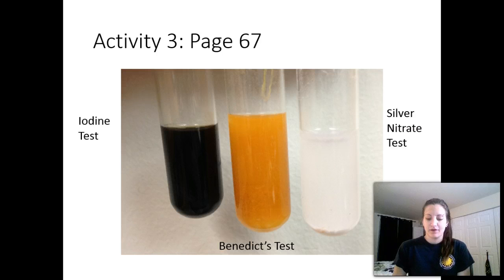Okay. So on page 69, question 11, it says if starch leaves the dialysis tubing bag, I expect the iodine test results on the water in the jar will be positive, because that means starch left the dialysis bag and entered the water. And so we should see that using the iodine test.